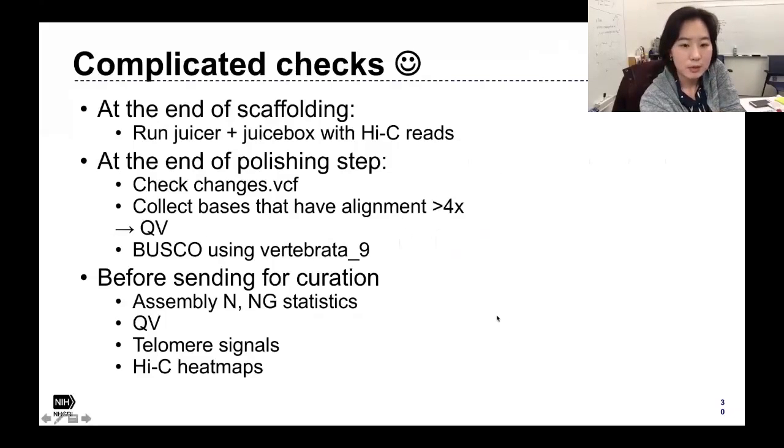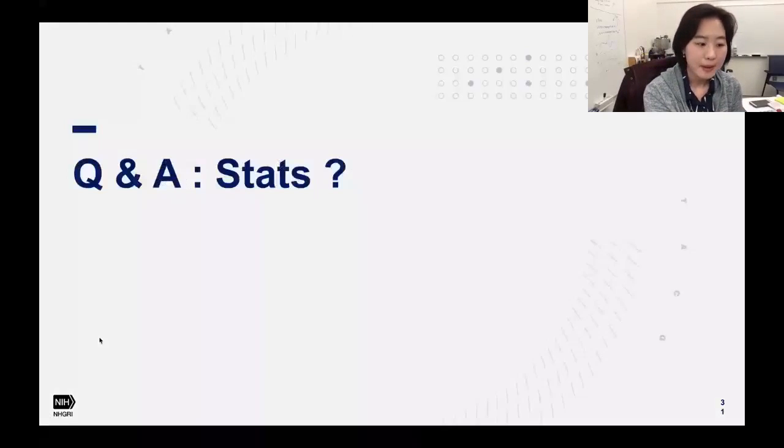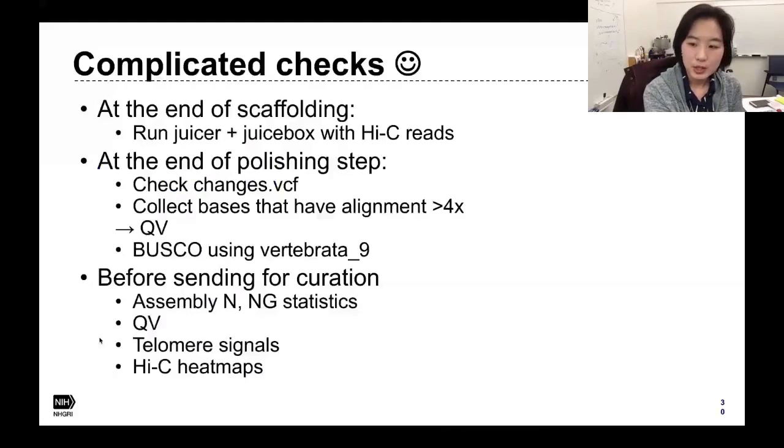And before sending for curation, you can do these steps locally and send it along with the assembly to Kirsten. But I think it's better to cover this in another training session once we have the assemblies ready for curation. Okay. So I can show you some Hi-C heat maps and talk about that.